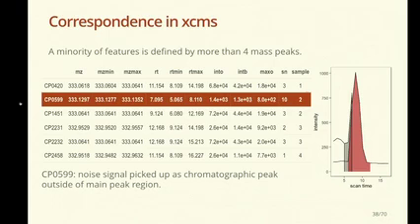And if you look more into detail in the data, it's effectively a noise peak, which was measured in the scans prior to the sample measurement, that has been grouped together with the ambient peak, which is of course not wanted as well, that we're including noise features from before the sample measurement in our actual ambient peak features.